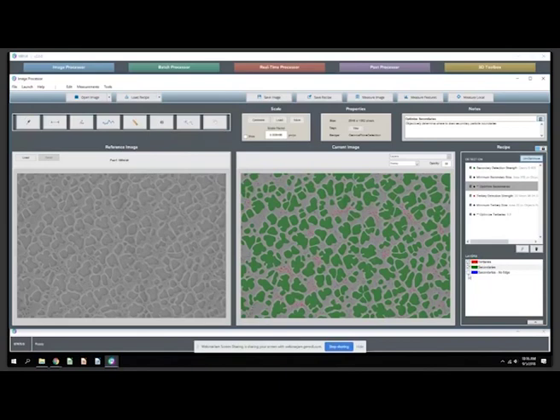So you'll see we also have another layer here that I've added where we've ignored edge features, and we'll use this when we make feature measurements. And the only things I want to hit on here are, this knob here controls the detection strength of the secondary particles. And this is using an edge find approach that is rather agnostic to overall intensity changes, image to image.